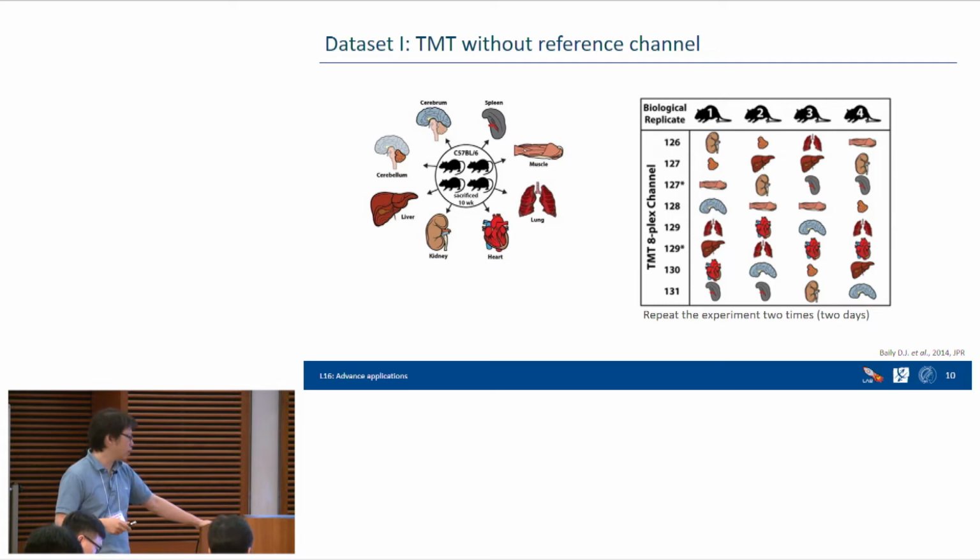For example, in single-cell data, you may not want to use the carrier channel for the analysis, so you can remove it. We also include more dimensionality reduction methods. In the current version, you can see we newly developed t-SNE and UMAP for clustering. In the previous version, only PCA was there.